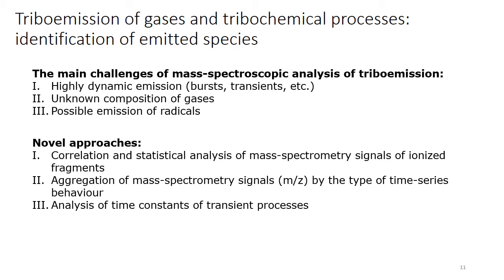So we analyze not only the peaks on the mass spectrum, but also the behavior of time series, which helps us distinguish to which molecule each ionic component corresponds. Finally, we can also analyze the time constant of transient processes, which provides very valuable information and accurate quantification.